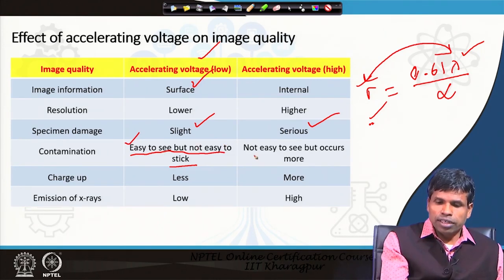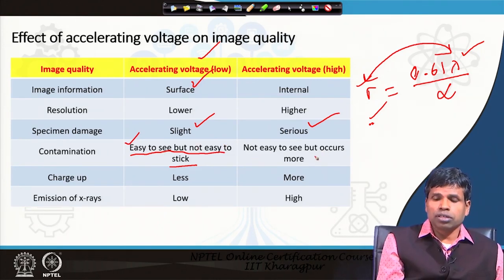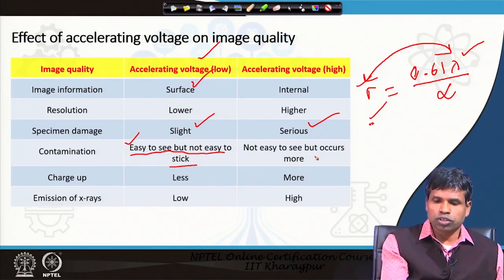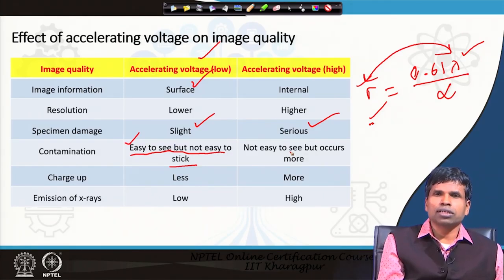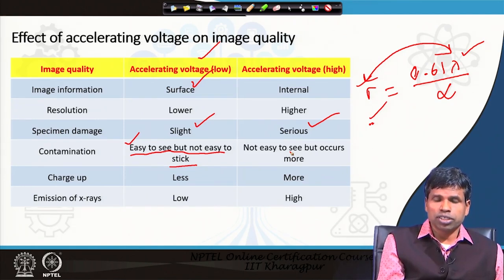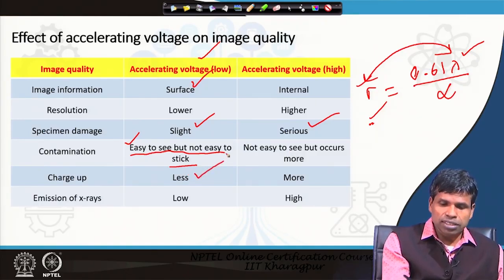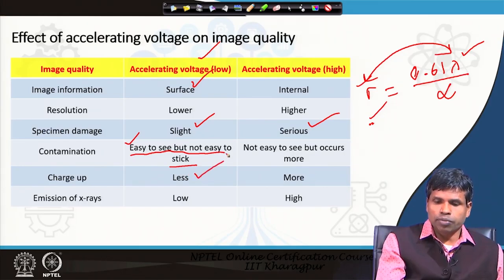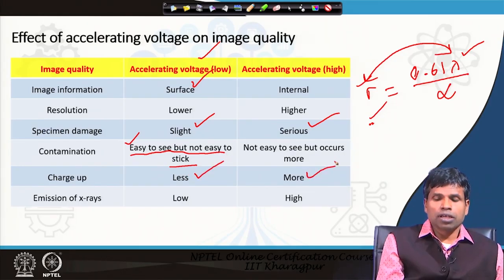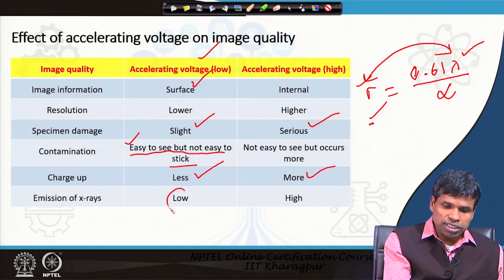At higher acceleration voltage, contamination is not easy to see because most information is coming from below the surface, but more contamination occurs — the higher energy beam more efficiently decomposes gas molecules and deposits more carbon on the surface. Regarding charge-up: as we discussed, lower acceleration voltage means less charge-up, while higher acceleration voltage means more charge-up.